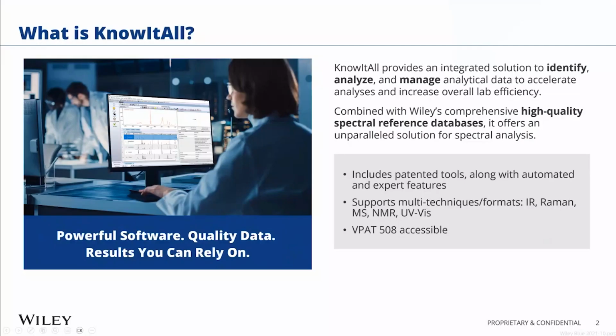Thank you, Mark. So what is KnowItAll? KnowItAll provides all the tools that you need for effective spectral analysis. When combined with Wiley's comprehensive spectral databases, you have an unparalleled solution for spectral analysis. You have access to the latest technologies with patented tools that you can't find in any other packages, plus expert and automated features to accelerate your workflows. KnowItAll supports multiple techniques, so whether you use one or several techniques, this is an ideal vendor-neutral solution for your lab. Even if you change instruments or add new techniques, you won't disrupt your spectral analysis workflow.